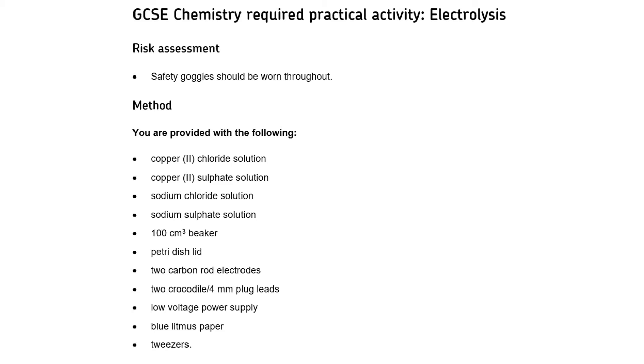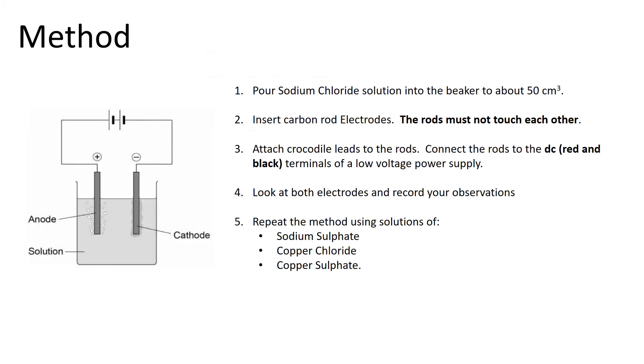The method for this practical is quite simple. We're going to pour some electrolyte into a beaker, starting with sodium chloride solution. We're going to insert some graphite carbon rods which will act as our electrodes, attach them to a low voltage power supply, turn it on, and record our observations at both electrodes. We're going to repeat this for four different electrolytes in total.